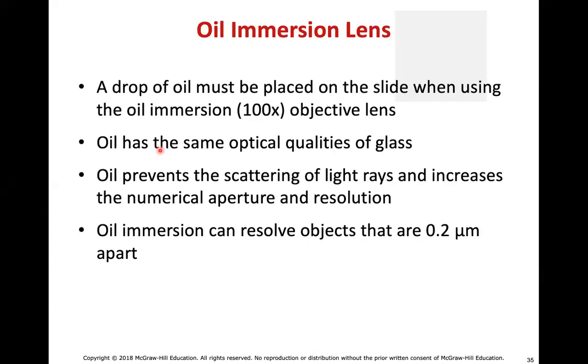Typically, and you unfortunately will not be doing this because this is an online course, but in an in-class lab, when you do get up to 100x or 200x, which is 1,000 or 2,000 total magnification, respectively, the light starts to scatter.